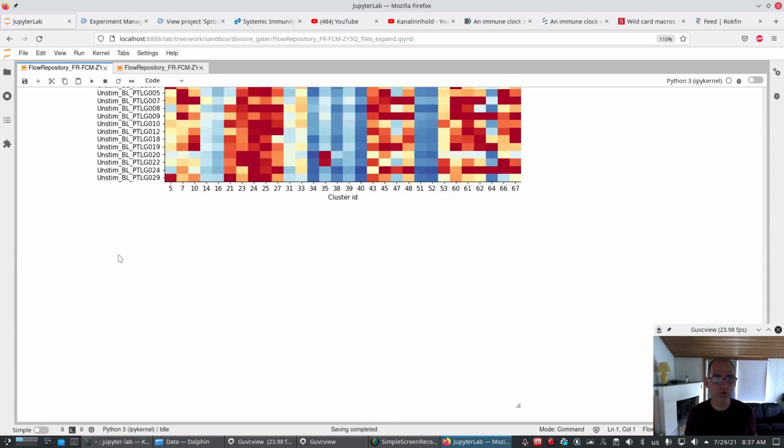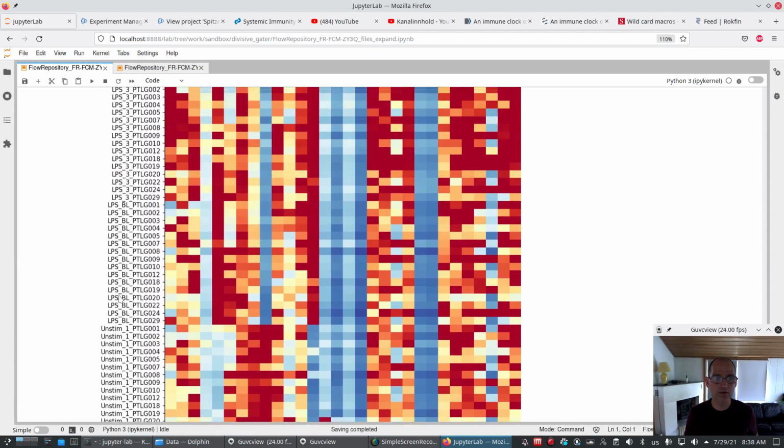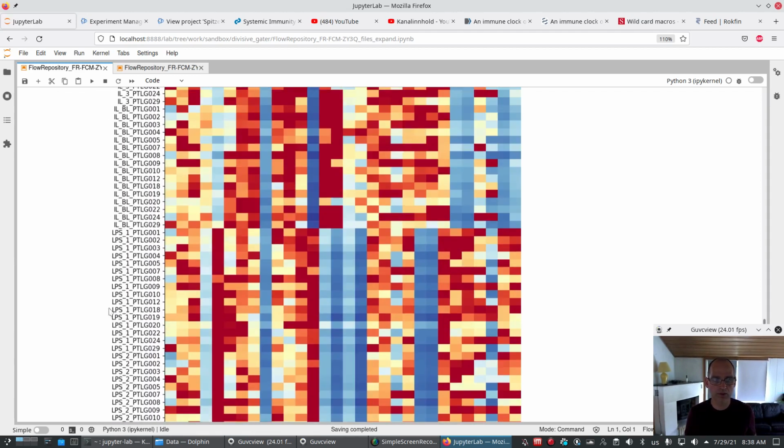Let's see, there's nothing more I want to show you. And we need to learn how to make these images in a way that we can communicate, but that's always a little difficult. The thing we can do is we can put a number. So I will do this in another video on another day.